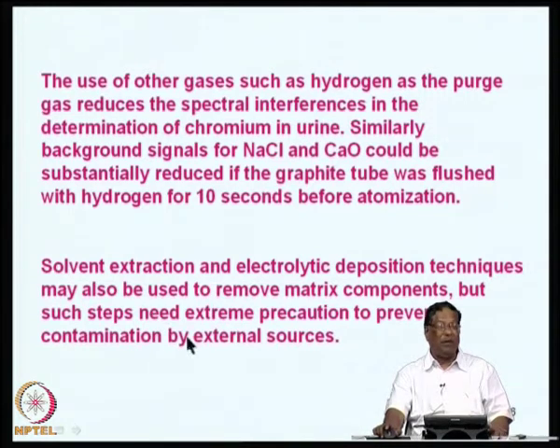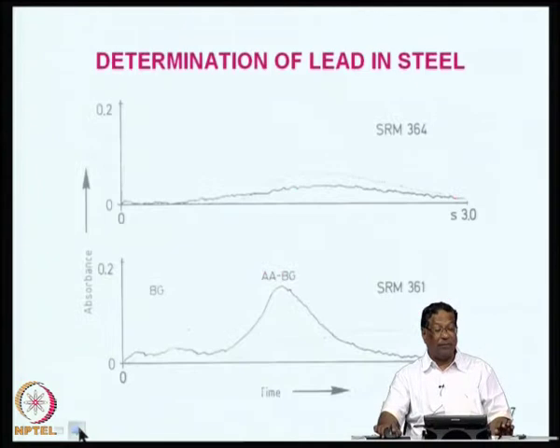but these are extreme steps. Such steps need extreme precautions, because remember you are always working at nanogram levels. So contamination is a distinct possibility, as well as losses of the analyte during experimentation. These things one has to do with extreme precaution.